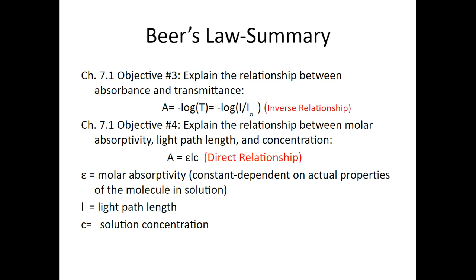So you have to really get it in a very dilute solution. I remember people fiddling with this, like 1 to 500, a really, really dilute solution of your sunblock. And then you use the UV spec and you get values and you can figure out the molar absorptivity of certain sunblocks. And there's a relationship of that molar absorptivity to its effectiveness, to how well it works. And it's a good kind of consumer thing.